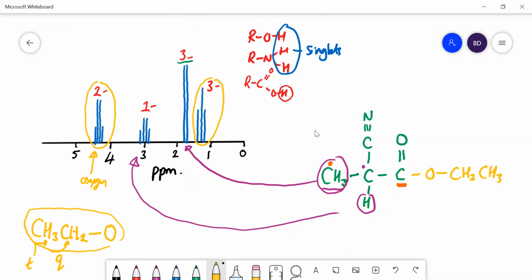We've got C6H9, 2 oxygens, and a nitrogen. We've got 2 oxygens in an ester linkage there. That is completely consistent with the NMR spectrum. So I think that is the structure that we're looking at in this question.